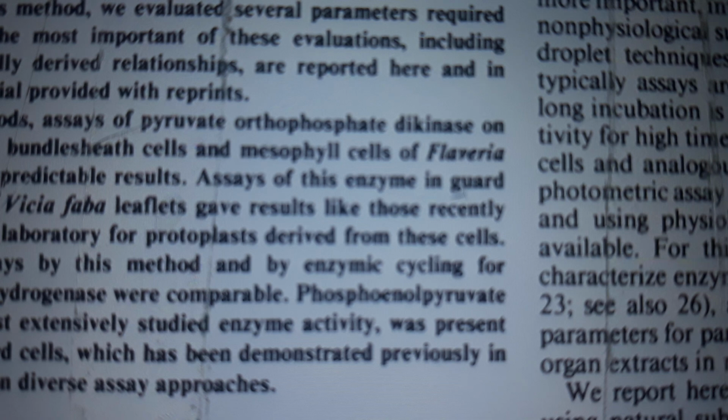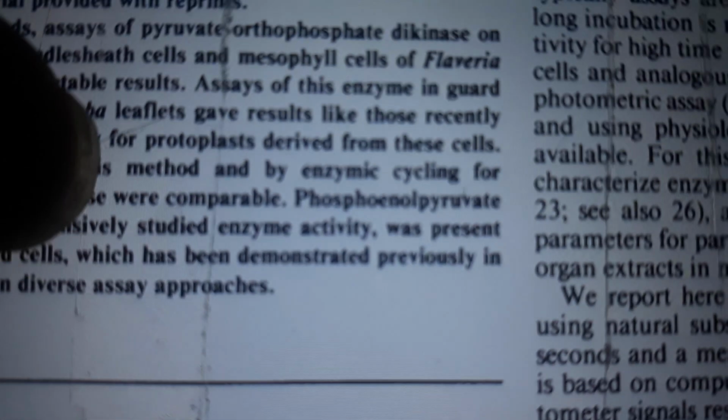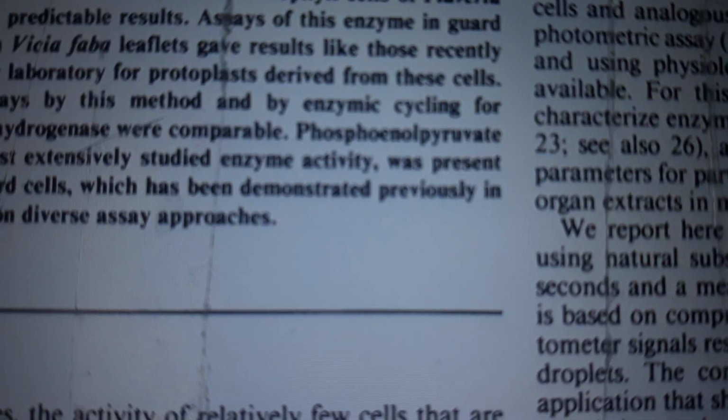Slide histochemistry is subject to artifacts arising from diffusion limitations throughout the tissue slide. Perhaps more important, interpretation of the results is confounded when non-physiological substrates are used, as in page 35. The use of microdroplet techniques allows one to avoid these problems, but typically assays are indirect.